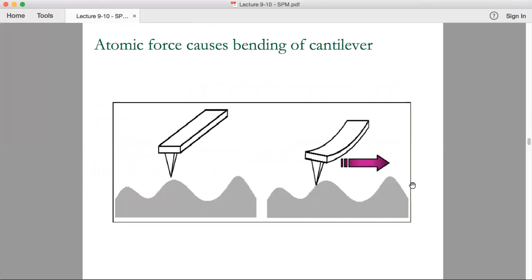So in atomic force microscopy, Binnig, Quate, and Gerber are the scientists who invented this AFM in 1985. The original AFM consisted of a diamond shard attached to a strip of gold foil, and the diamond tip contacted the surface directly, with interatomic van der Waals forces giving the interaction mechanism. Detection of the cantilever's movement was done with a second tip, an STM placed above the cantilever.